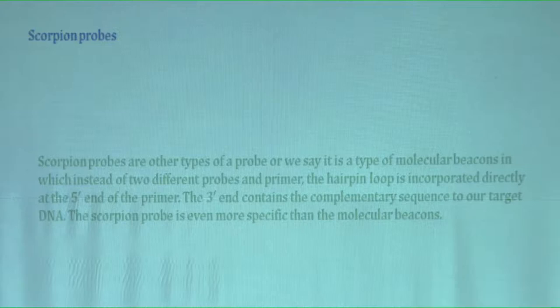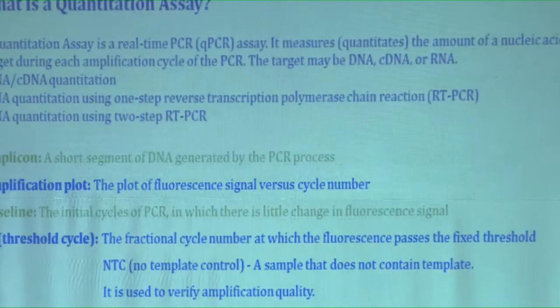So we have an intercalating dye directly, where SYBR Green is used. We also have probe based methods for quantification, where we have TaqMan assay, molecular beacons and scorpion probes. Some of us may not be going into all that level, but you should appreciate that, depending on the resolution or accuracy you want in your data, you have to select which qPCR method you want to use, right?